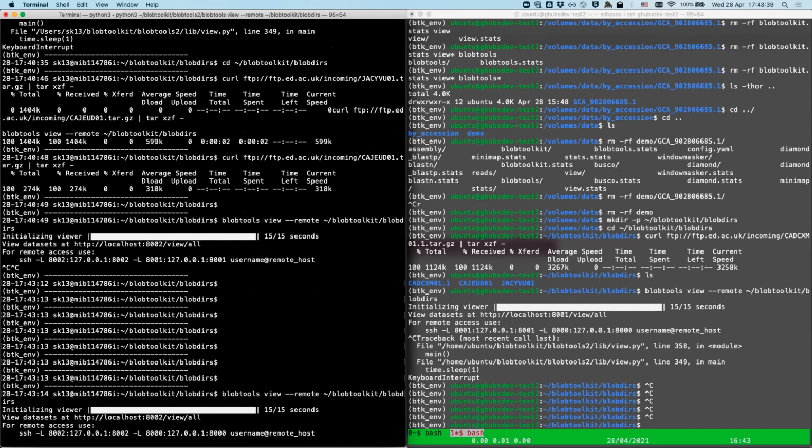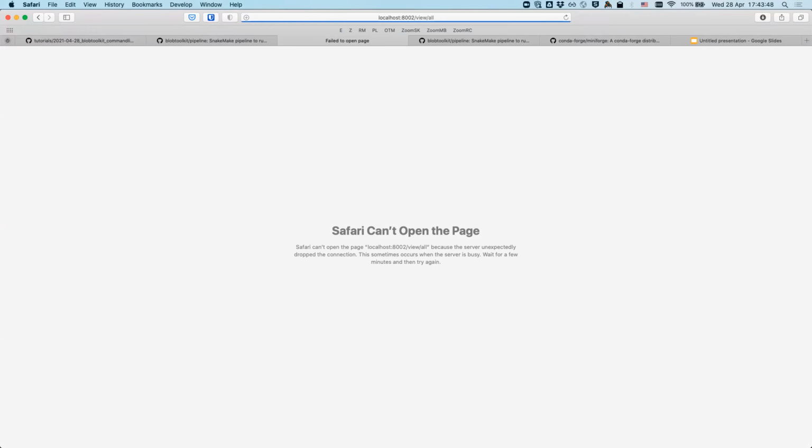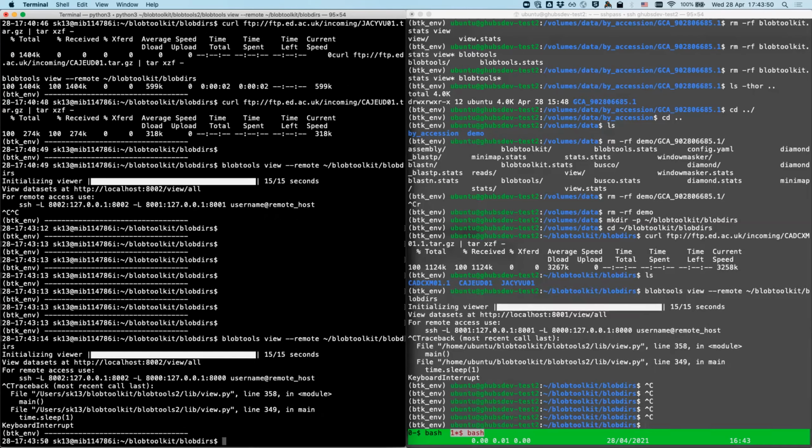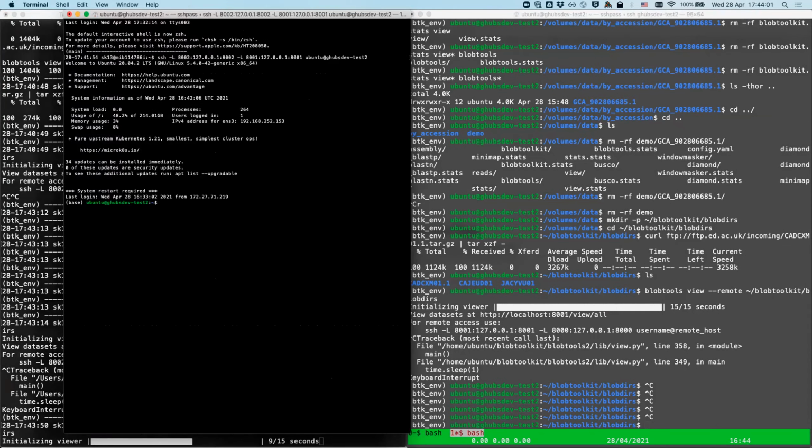That looks like it makes more sense. Nope. I think I've broken it. I killed it, started the command again. It's because this is open. Sorry, I've confused myself.